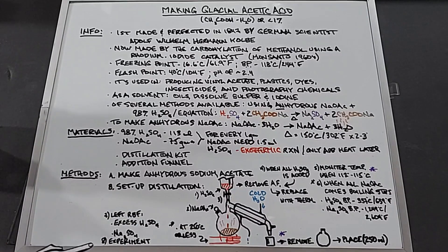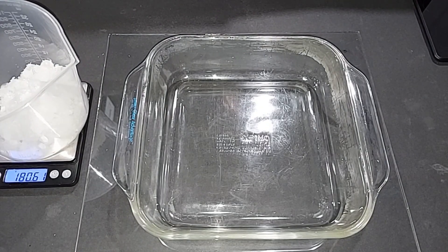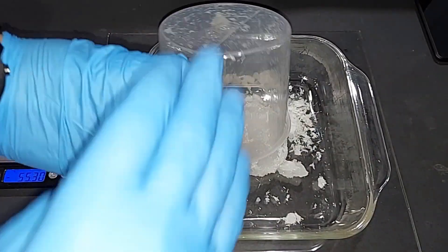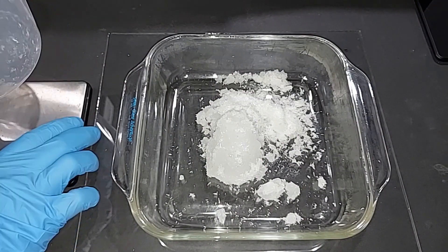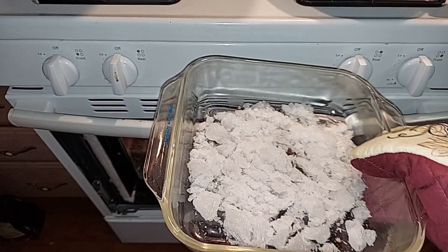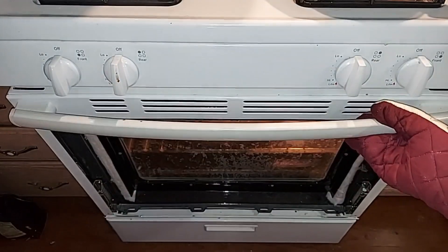I've got about 180 grams of sodium acetate trihydrate made a couple weeks ago. To make glacial acetic acid, it can no longer have any hydrate water, so I'm going to dry it out. I spread it out in a pan, chopped it up a bit, and I'm putting it in the oven at about 310°F (153°C). I'll check on it periodically.